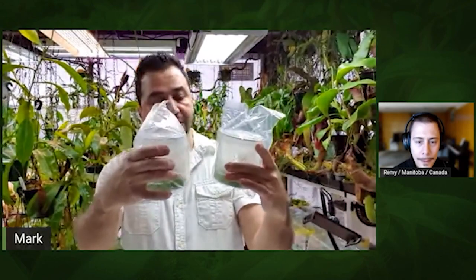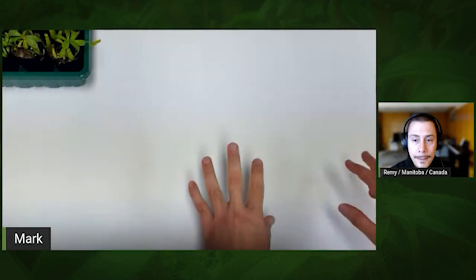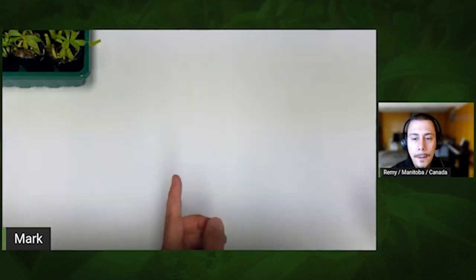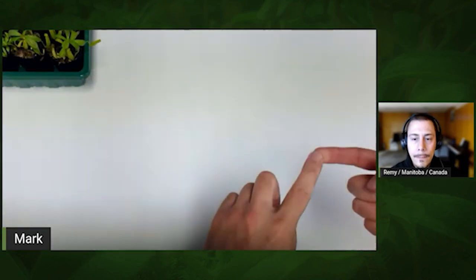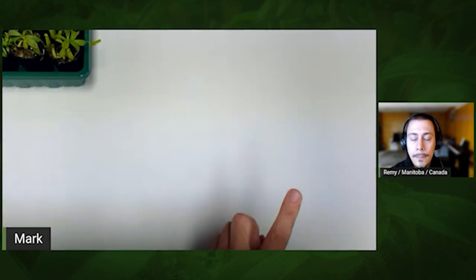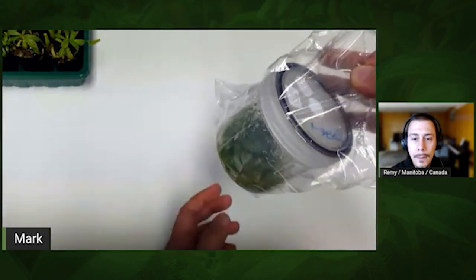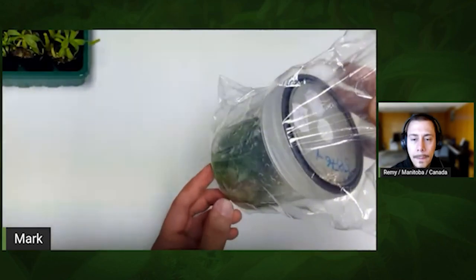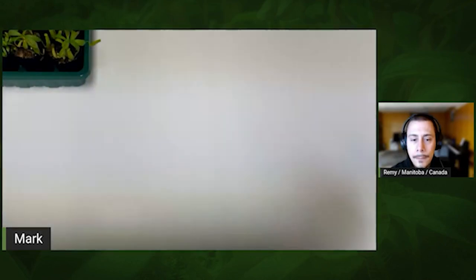So what will we unflask today? I have two flasks of Ambularia here, and as you can see they're still sealed, so even I have no idea what to expect — we'll find out together. The first and most important thing for any successful deflasking: clean everything. So many people think about lights, temperature, and media, but for me, everything being clean and sterile is number one. These plants have been in these containers since they first came to life — no contamination — and they are very sensitive. Anything can get them.